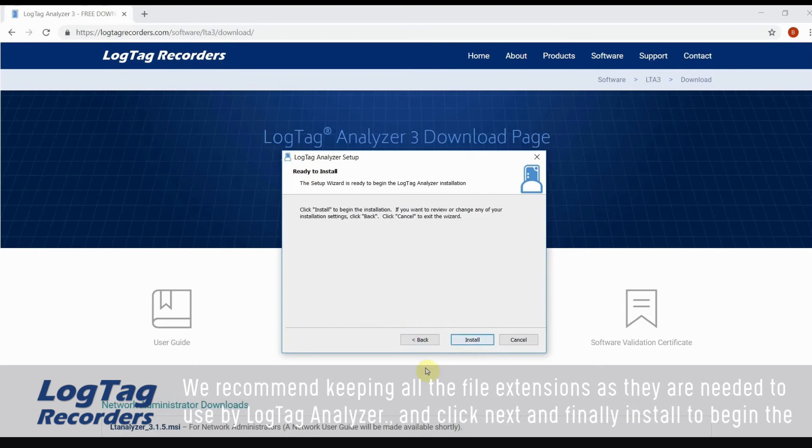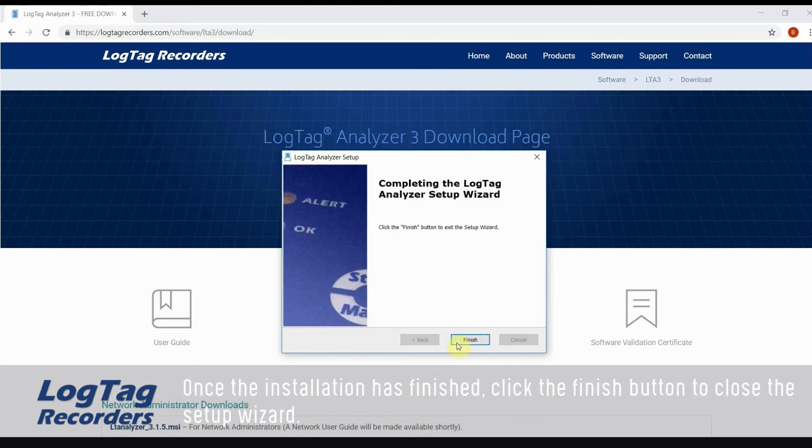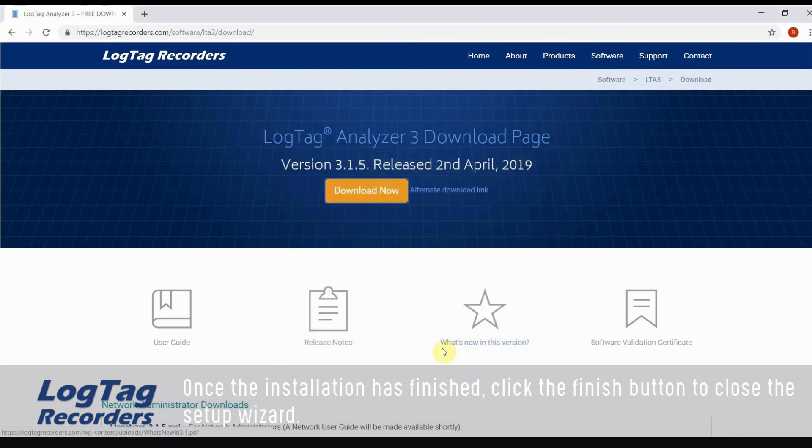Finally install to begin the installation process with the settings you have chosen. Once the installation has finished, click the finish button to close the setup wizard.